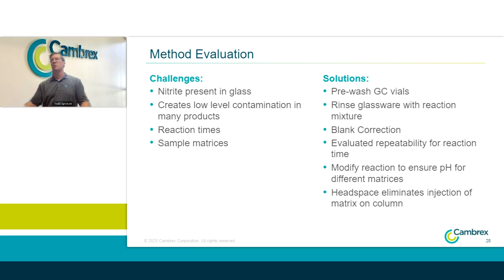We did work through some of that. We looked at pre-washing the GC vials. You can rinse the glassware with the reaction mixture, as there's a significant concentration of the cyclamate in the diluent that's used. There is the possibility of blank correction as well. And then we've evaluated the repeatability for that reaction time. And again, modifying the reaction to ensure we're reaching the appropriate pH for that reaction.